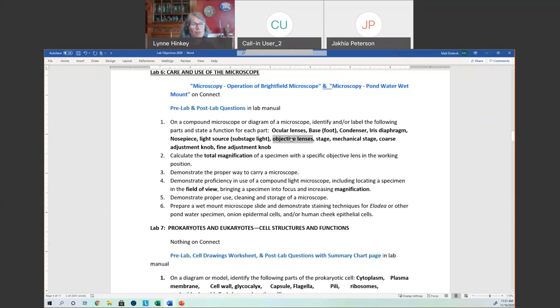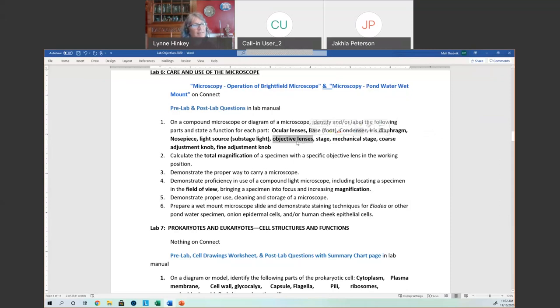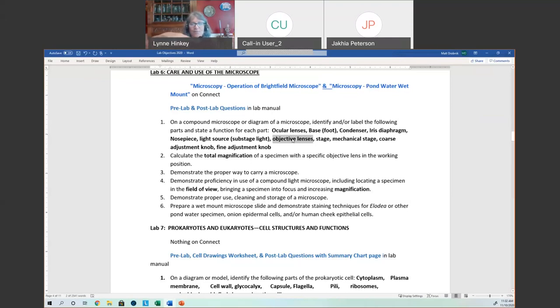After I bring it into focus with the scanning lens, to get to higher magnification I'll use my rotating nose piece to go to the next highest lens — my 10× magnification with the yellow ring. When I do that, I never use that coarse adjustment knob again. Our microscopes are par focal, meaning if I'm in focus with my scanning lens, I should be in focus as I move through all the other lenses. There's a little drift, so I just need my fine adjustment knob to bring it into sharp focus. I only use my coarse adjustment knob with the 4× scanning objective lens, because that moves my stage in big movements — any movement is going to take me out of focus faster than into focus, and there's a chance I could crack the lens or the slide.